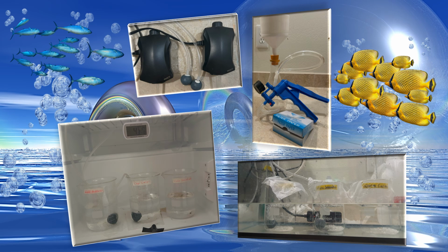At the top left, you'll see the bubblers that I'll be using. They're adjustable. For the active, it's set to the maximum, and for intermediate, it's set to the minimum. I will also be using a vacuum flask filter thingy, as it will just help with the calcite.